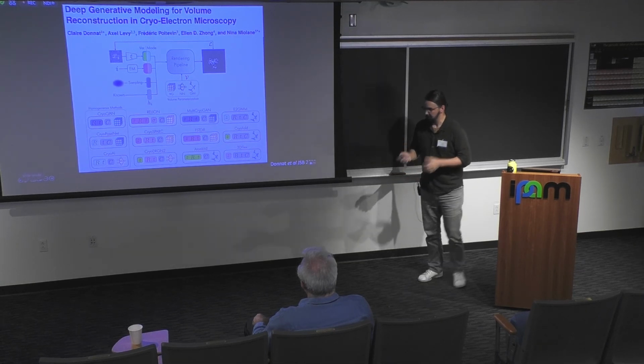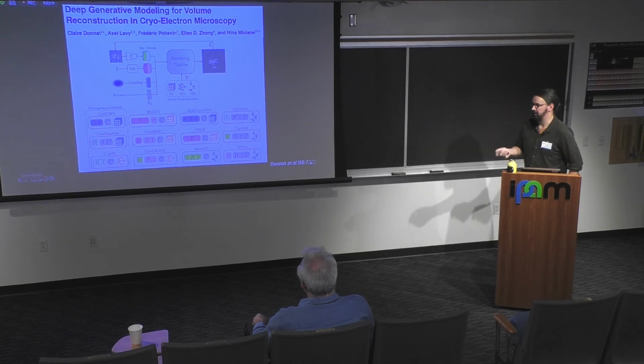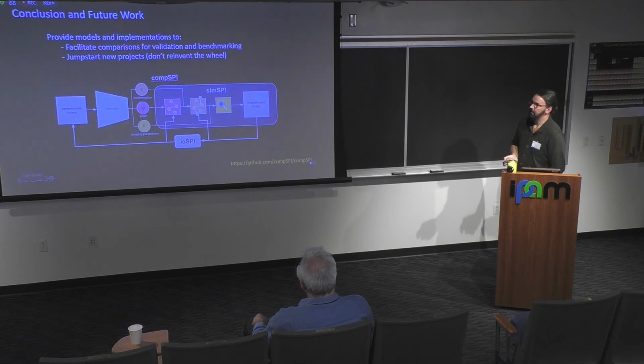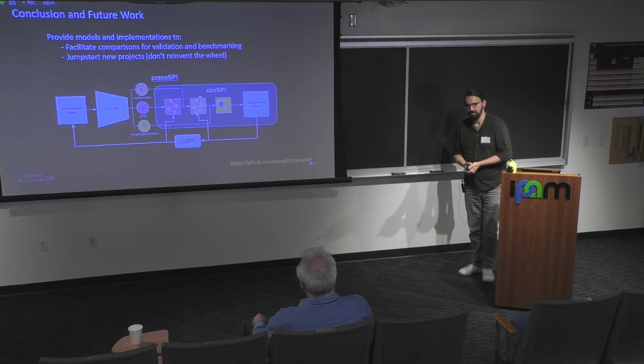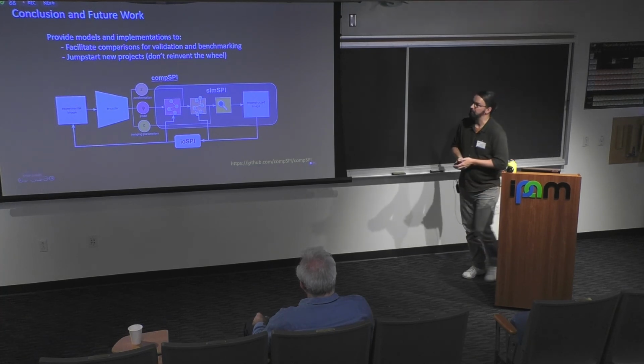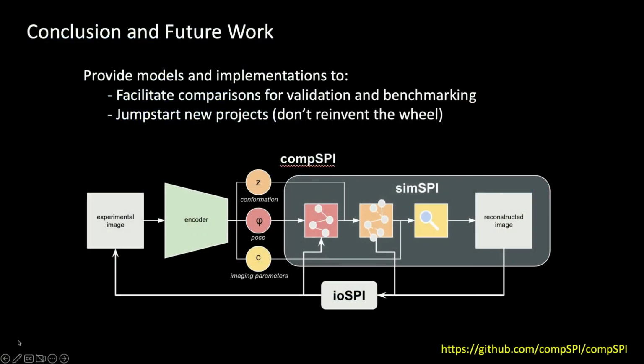It's a very dense and rich review, but it just came out in the Journal of Structural Biology, so please check it out and tell us what you think. One of the main outcomes of that work was that we realized there was a lack of validation and benchmarks. I think everybody in the room agrees that we might want to push on that front, because it's very hard to compare different methods to know, as a practitioner, which one is the best for my needs.